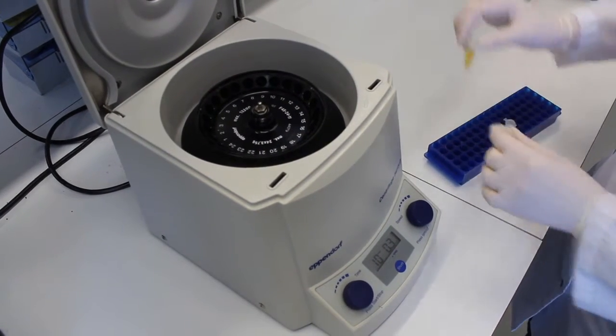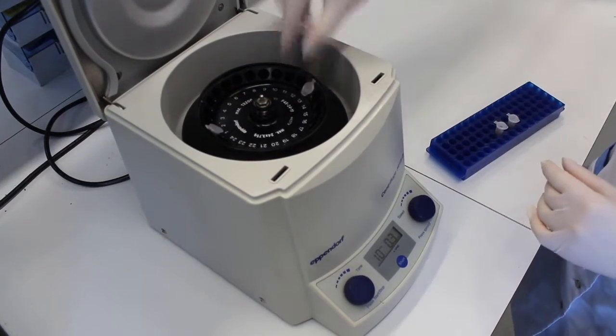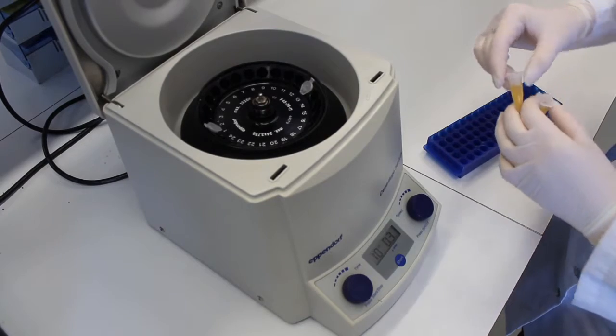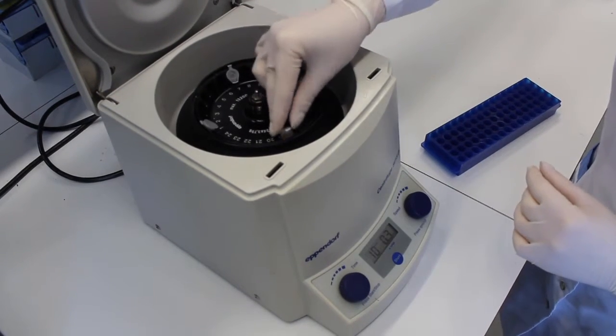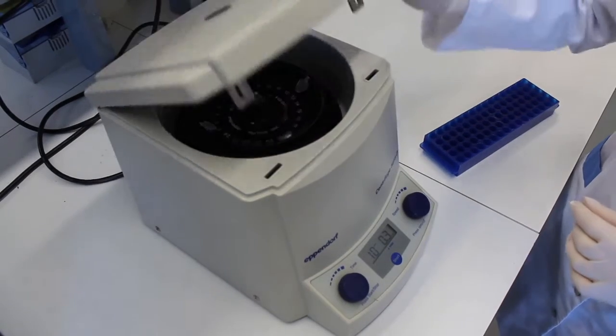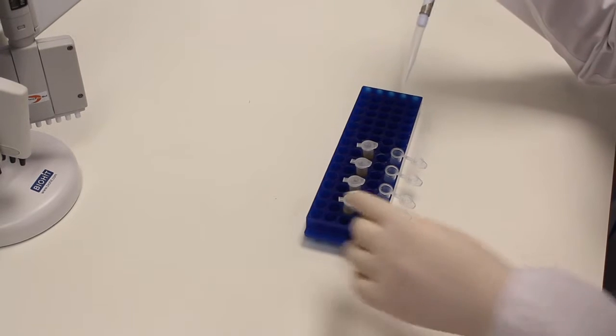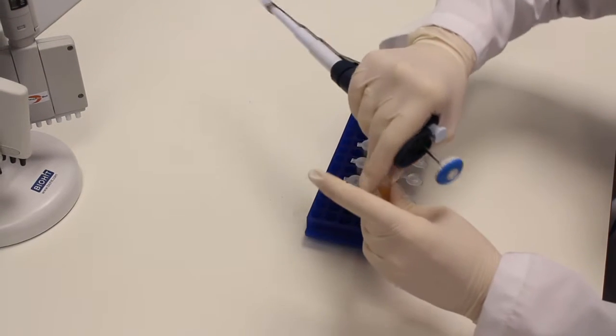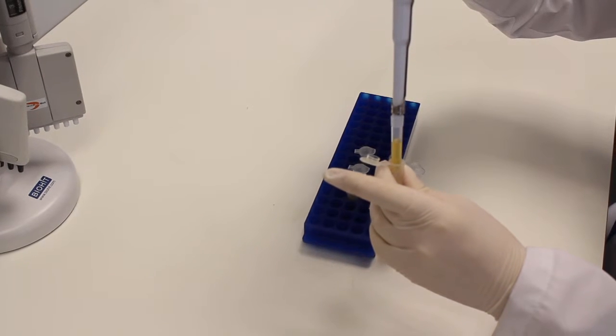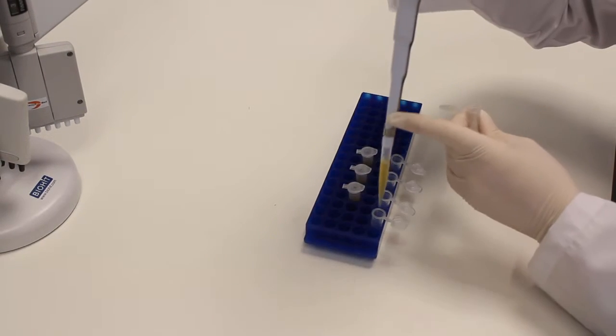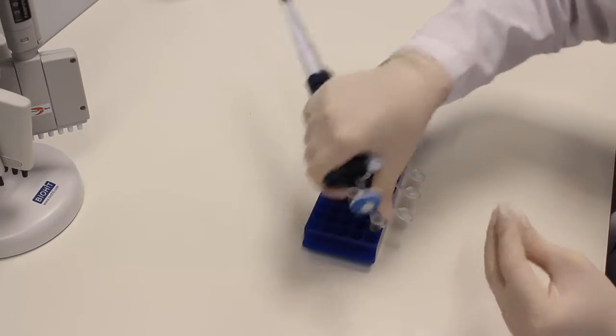Prepare your samples by three centrifugation steps. First one, 10 minutes at 300G. Second one, 20 minutes at 1200G. And third one, 30 minutes at 10,000G. After each step, transfer the supernatant into a new tube and discard the pellet.